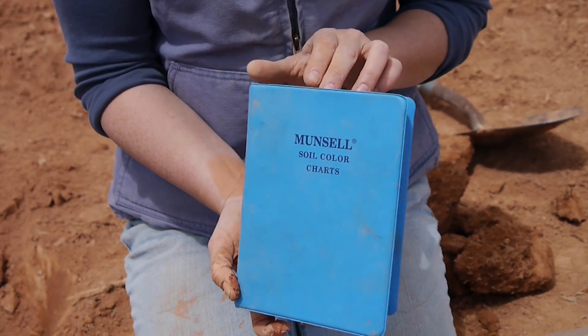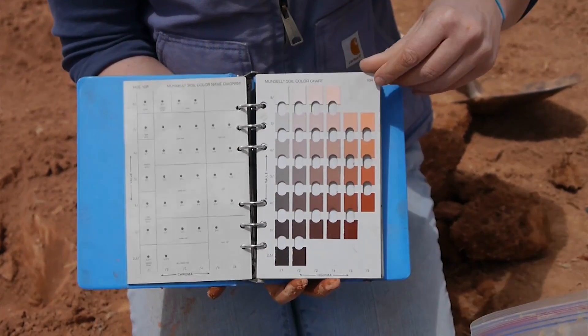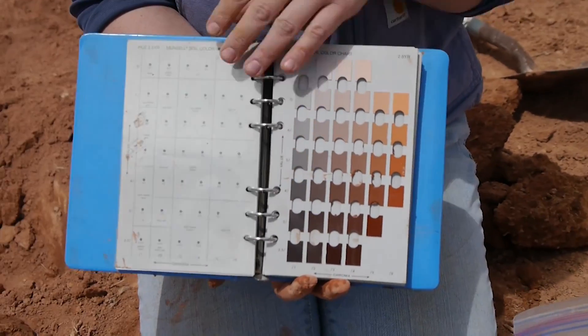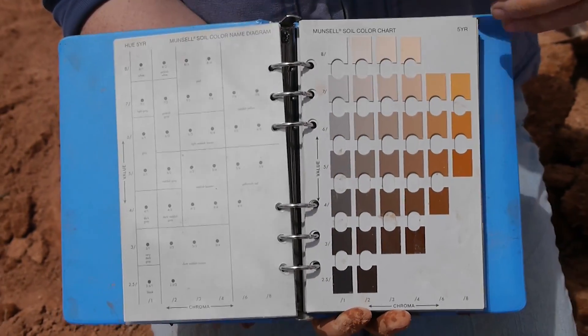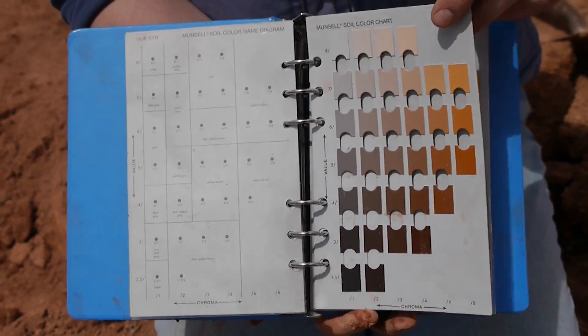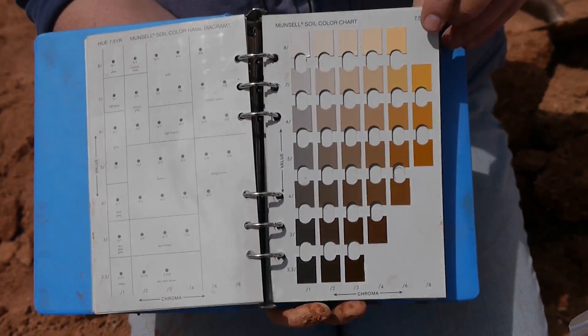The Munsell color book is a standard color methodology. What we've got are different pages in here with color chips on them. Each page is a different hue, and the hue is identified by a notation in the upper corner. The hue is how red or yellow the soil is.